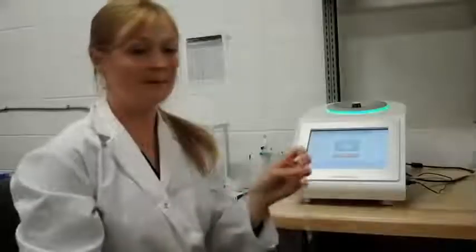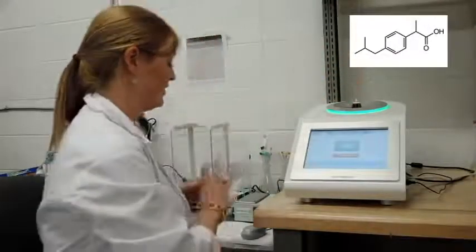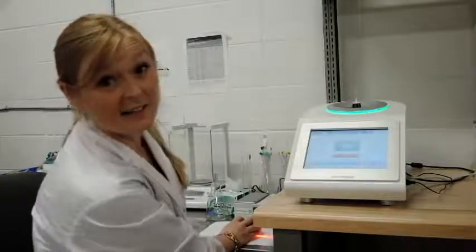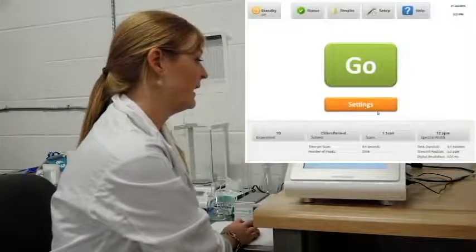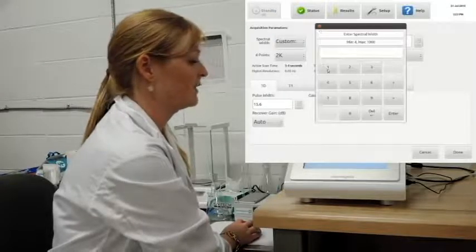I'm going to go ahead and run my last sample. It's a 0.5 molar solution of ibuprofen in chloroform. So I'm going to go ahead and change my solvent back to chloroform. Because I have a carboxylic acid, I want to extend the spectral width a little bit, so I'm going to go into settings, and I'm going to choose a wider sweep width. So I'm going to go into custom, select the value that I'd like.